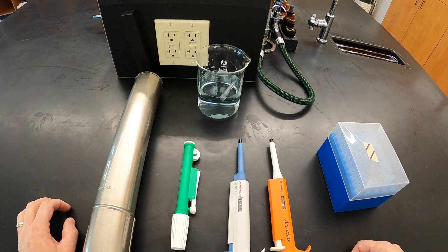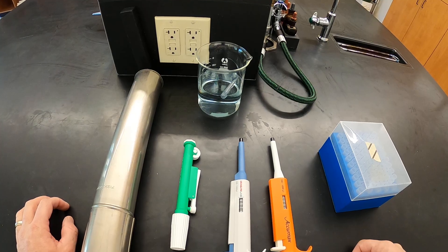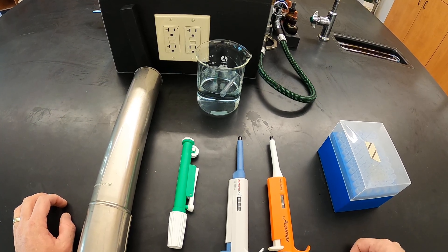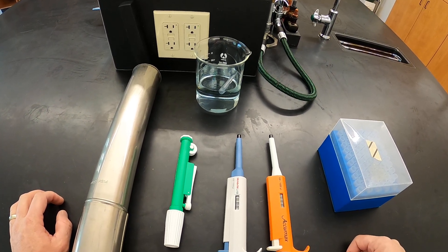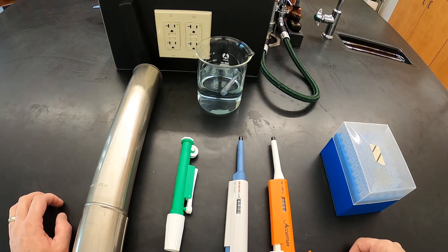The purpose of this video is to introduce to you some of the pipettes that we're going to be using for our aseptic pipetting portion of the lab this week.